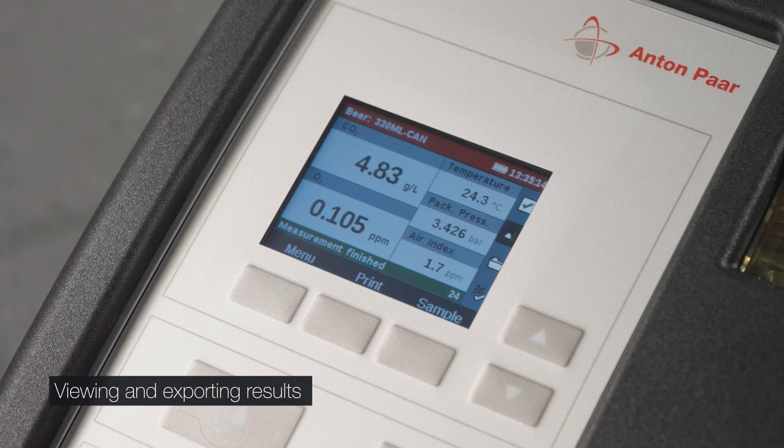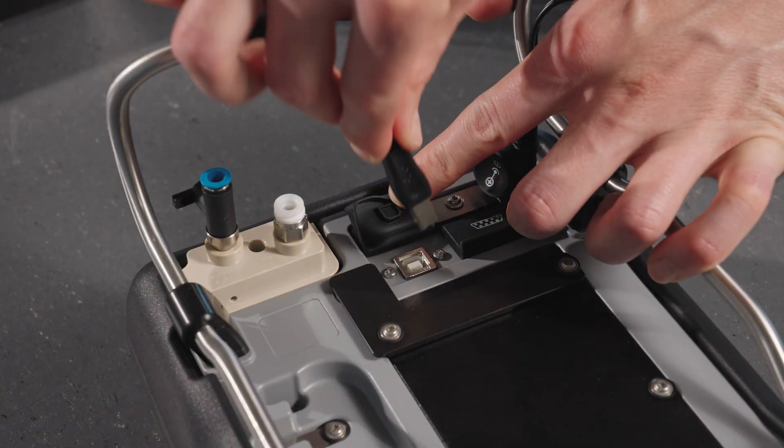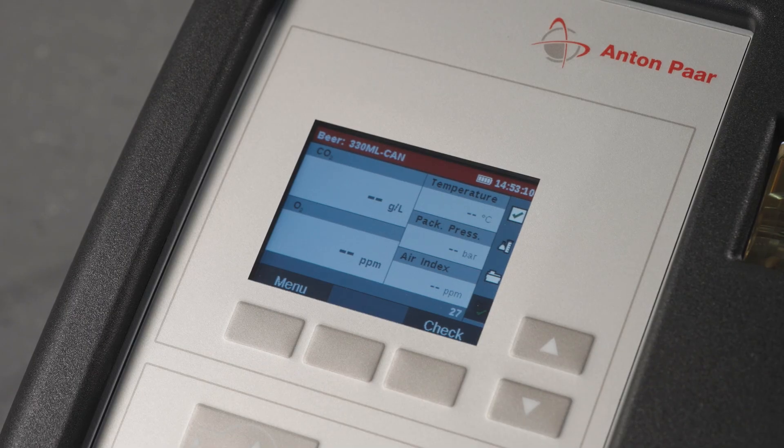After measurements, rinse the instrument with deionized water. The results are shown on screen and stored in the instrument's memory. Data can be exported to a PC using a USB or the AP Connect adapter.